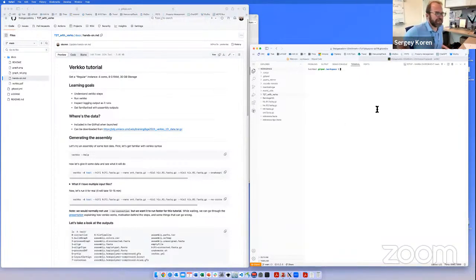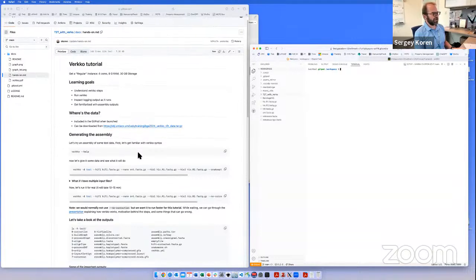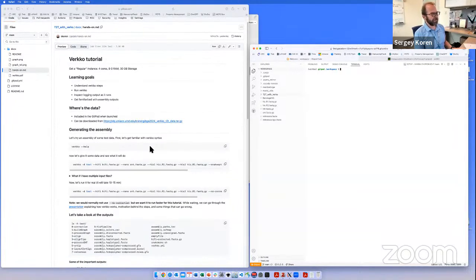It takes a minute because it's going to install Verkko and do everything like that. But I'm going to start showing the commands, and I'm just going to be following along hands-on. So if you ever want to go back and view the recording, and you're not following along live, all the commands and everything I run will be available here. So you can just redo it at your own time if you don't have time to do something or you miss a part, you want to go back and redo it.